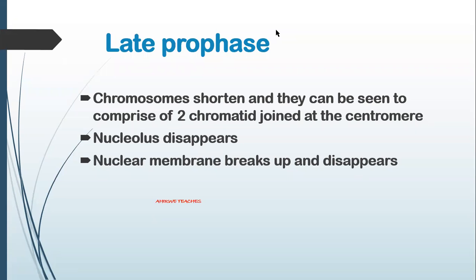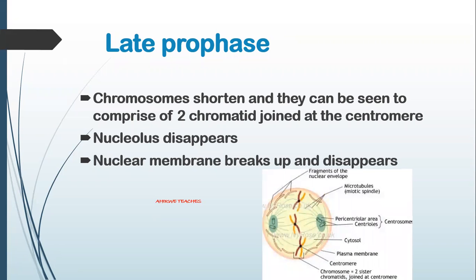They divide, they replicate in interphase. So here they successfully separate so that each cell that is formed has the exact copy of the number of chromosomes. Then the nuclear membrane breaks and it disappears. And you prepare. Now this cell, this is really late prophase, okay? The cell that is really transiting into another phase of mitotic cell division.